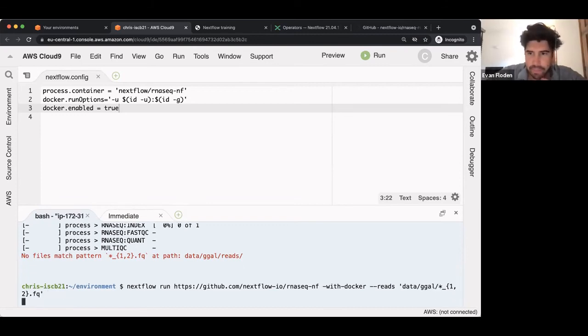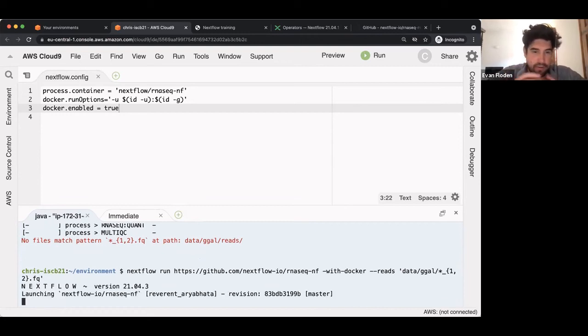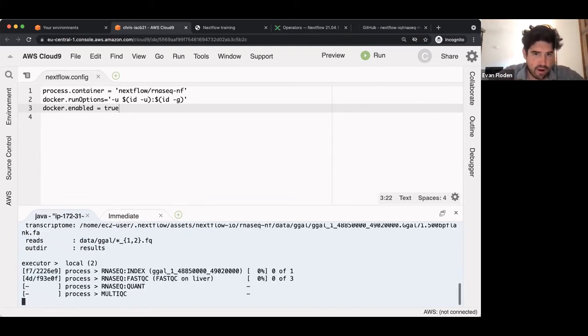And so we run here, and now I'm combining these things together. You can see that will run through, and it's running on my own data now. So pulling something from GitHub, running on my local data. There's an option now, will resume work. With the cache option will resume work as well if you use resume. In this case, there are subtle differences in the pipeline, so it wouldn't have worked the first time I ran it.